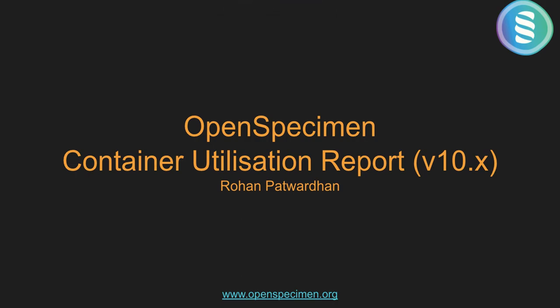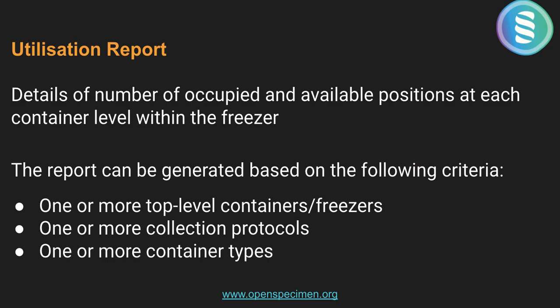Today I will be explaining the container utilization report coming with OpenSpecimen version 10.x. The utilization report contains details of the number of occupied and available positions at each container level within the freezer.